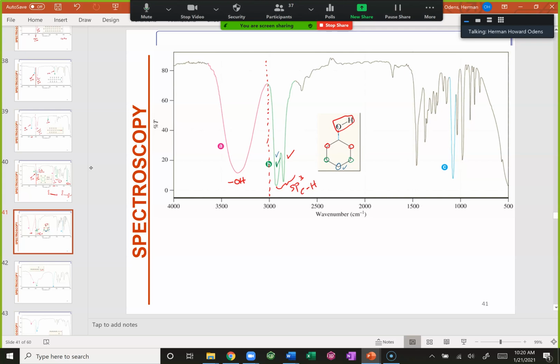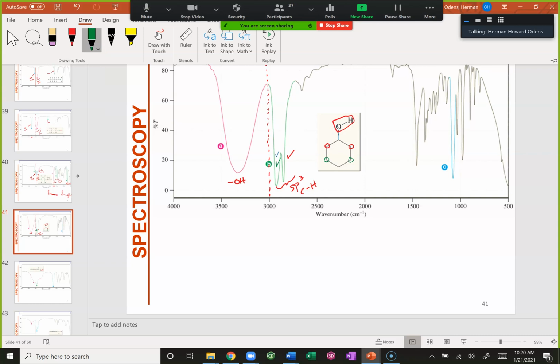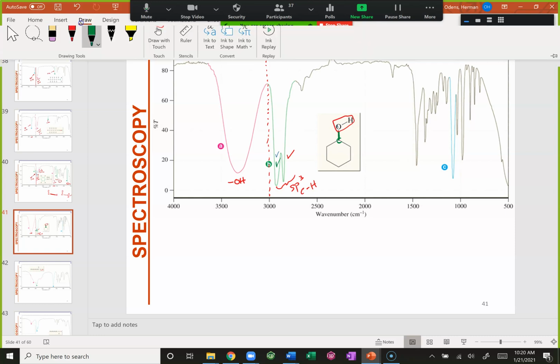All right, so the next thing we're gonna confirm here is our CO stretch. This stretch is this one right here. Oh, no, sorry, my bad. You didn't see that. This one. Here's my C, my O there. That's my CO stretch right here. And we'll be able to now identify 3 sets of signals. Let me do this in red to keep it consistent.